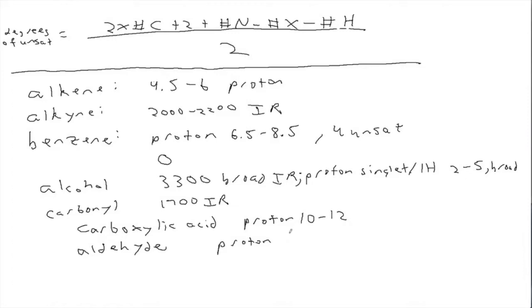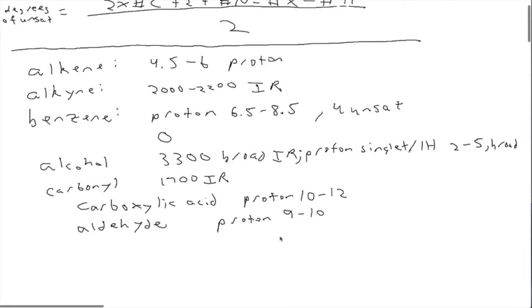Aldehyde would be from 9 to 10. And notice that's the only absorption in the 9 to 10 region. So that guarantees that you have an aldehyde. So that's something that, again, is especially useful for us to watch out for.